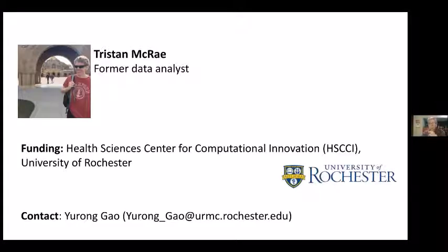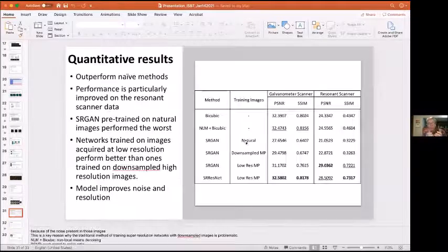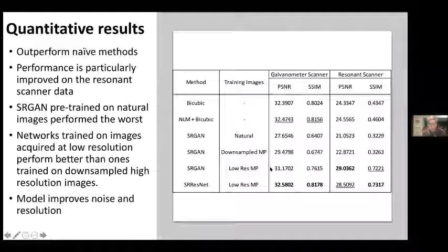I had a question about the evaluation of the results. You showed the visual results, and that kind of makes sense. In your statistical analysis, for example, the similarity measure that you have there, were you using the high resolution version as a reference? Exactly. Okay, I see.